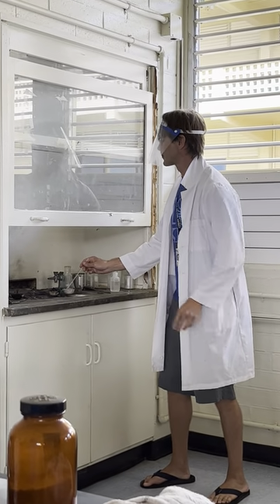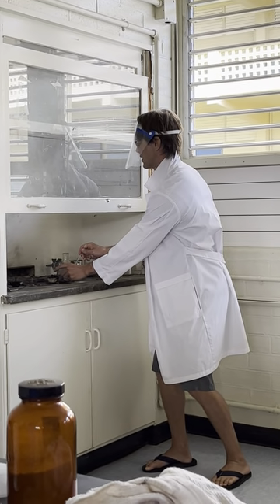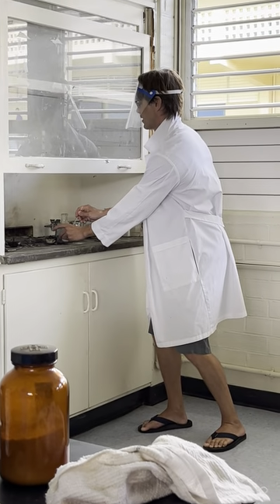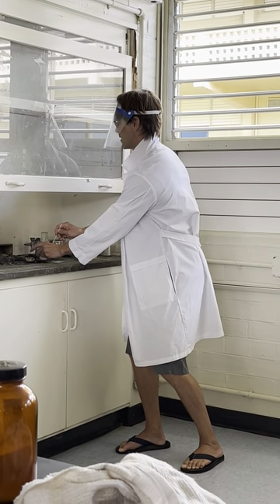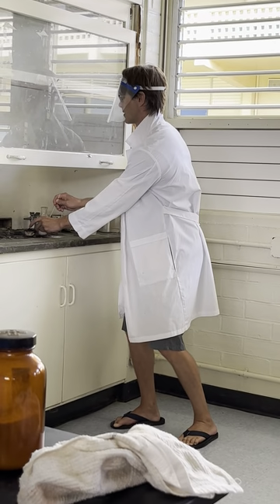Hopefully not. So I've mixed this strong oxidizer with some sugar, and I'm going to see if we can. It, like I said, it's really clumpy. I'm not sure how well this is going to work.